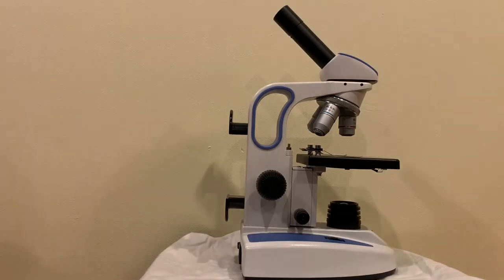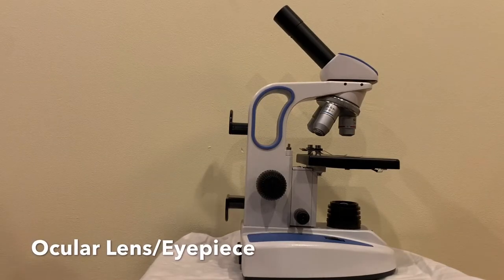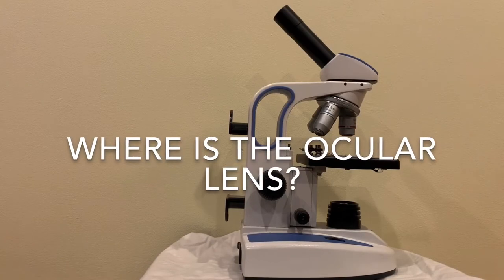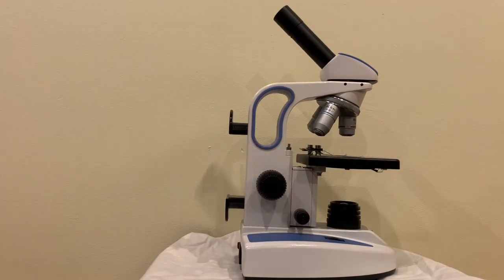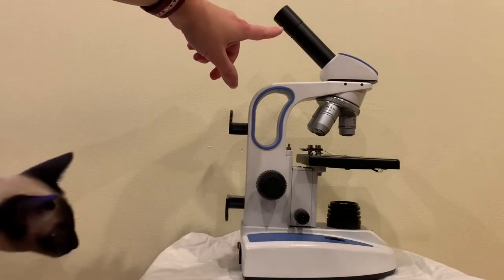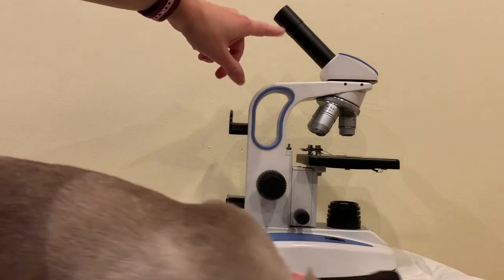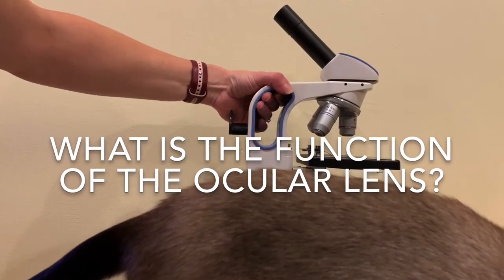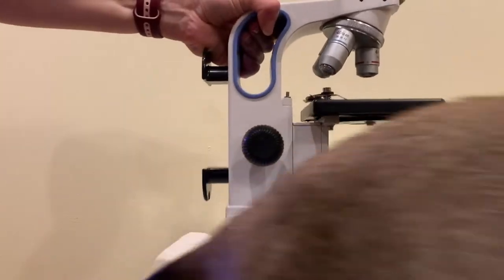Next we have the ocular lens. Where is the ocular lens? Very good. The ocular lens is up here and what do we do with the ocular lens? We look through it. Very good.